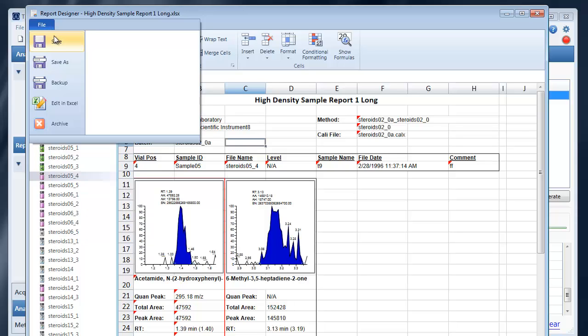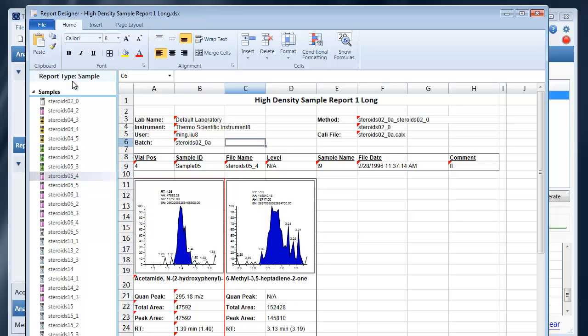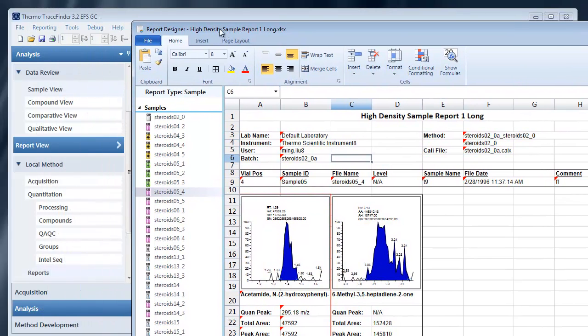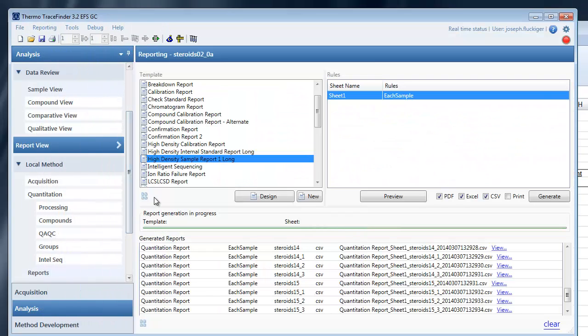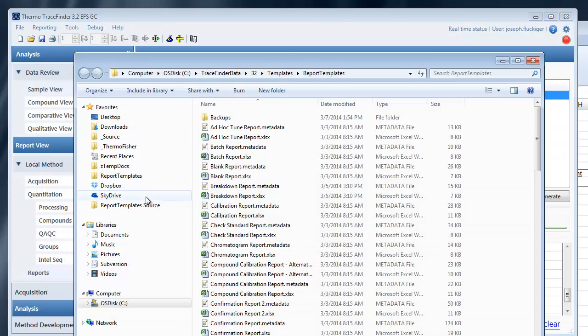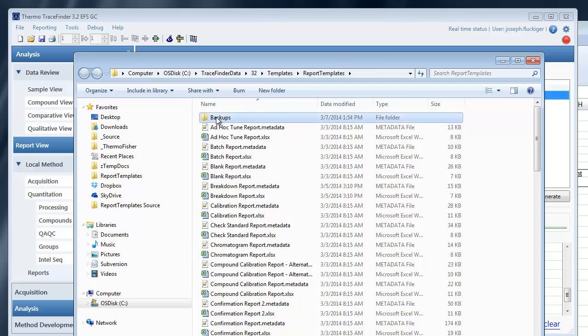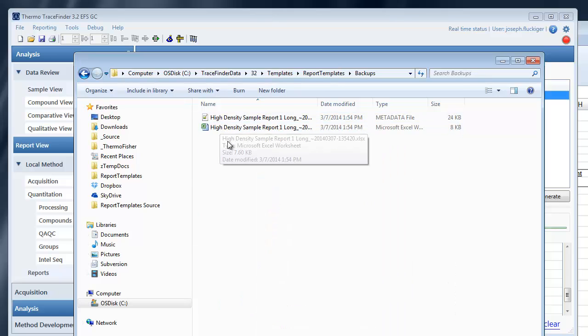You have the file menu through which you can save or save as. You can back up a template. Backing up a template will cause a backup to be stored here in the backups folder with a date time stamp.